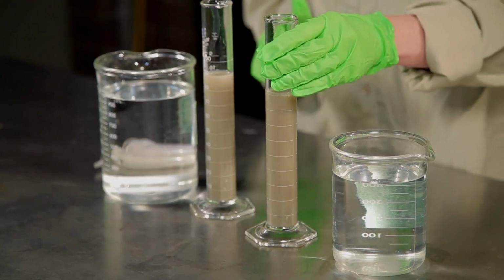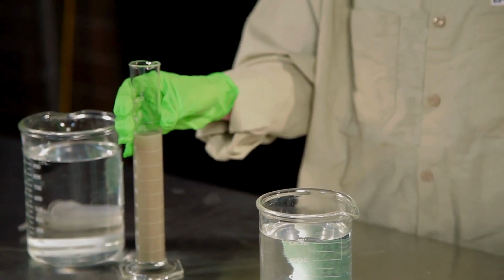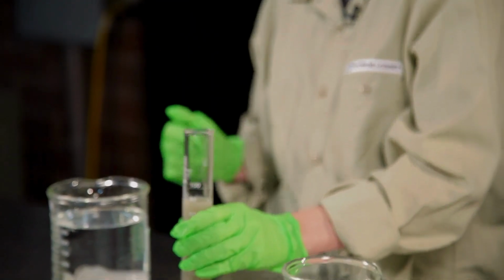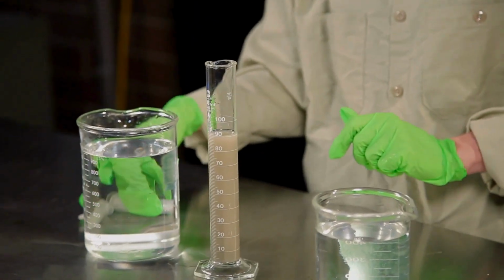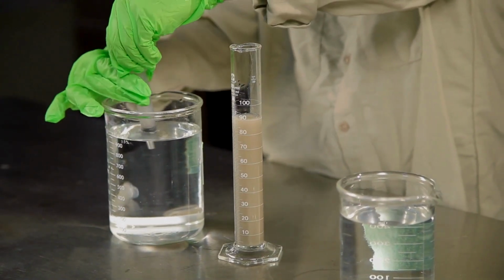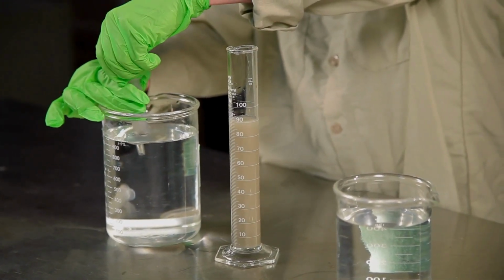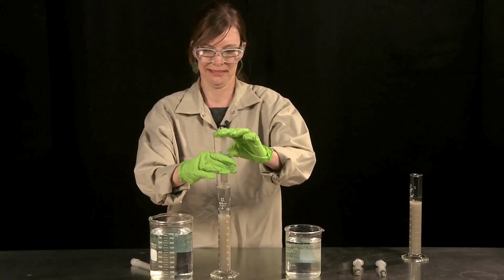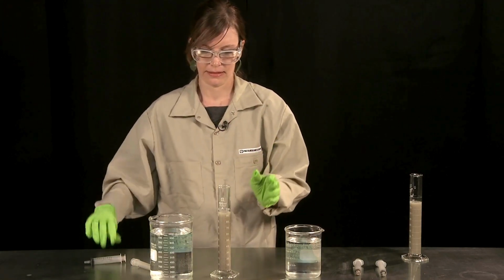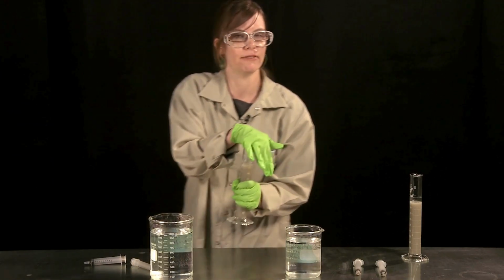Here is another sample of fresh slurry, which I'm going to now add coagulant and then flocculant to. So once again, I'm going to take my dose using a syringe. Okay, once again, I'm going to mix by inverting the cylinder.